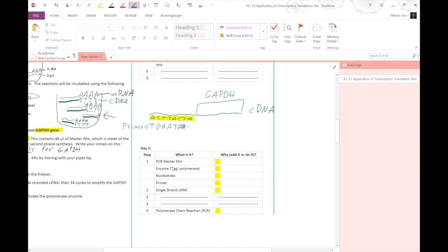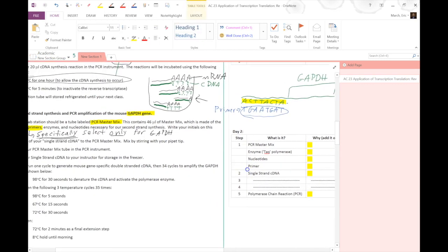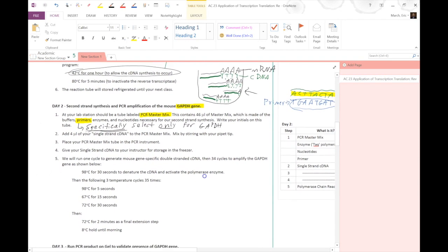Remember, it's DNA, so we're using T's instead of U's. So this here is the primer that we've purchased, and it will bind only to the sequence just before the GAPDH gene. And then what we're going to do, let's go back over here.